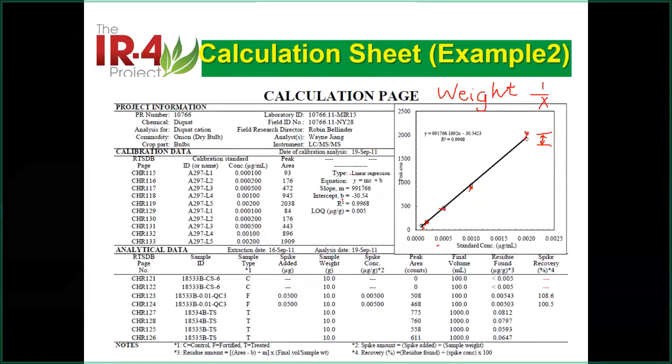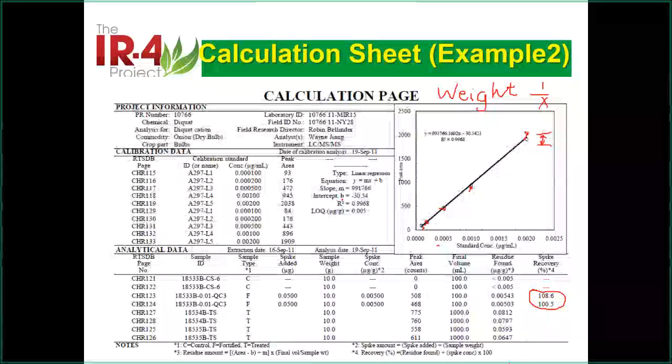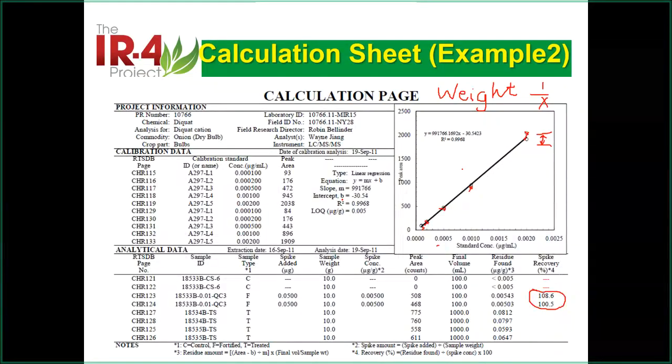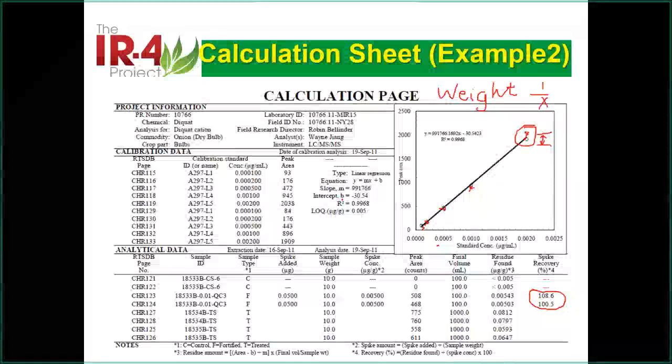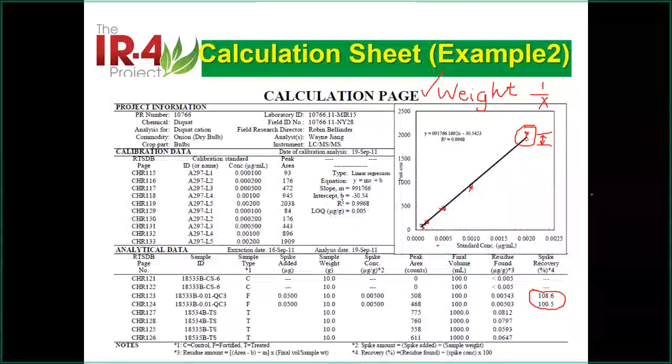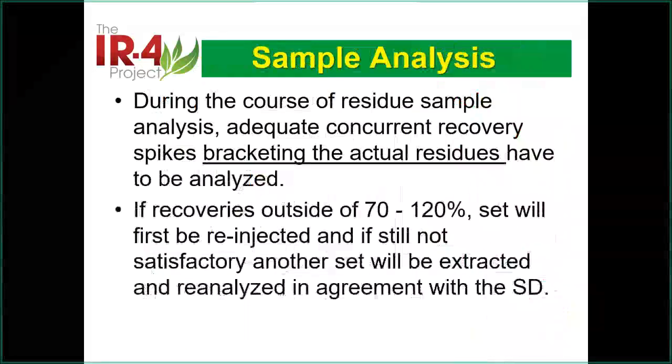It's linear, but we don't have weight. Normally, we put it there. Then I will get probably around 100% for both of them, very close, or 99, 98. That's because with the weight, you treat them the same. But this difference really makes a big change in the R squared value without weighing. You can do that, but if you calculate by hand, it will be difficult. The software can do that. So I'm not going to talk about this. This is another paper. You can write it down.